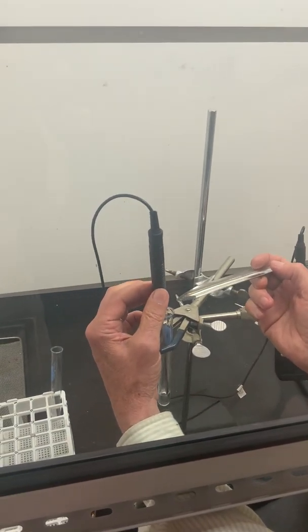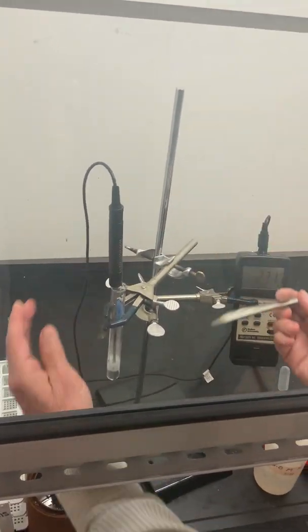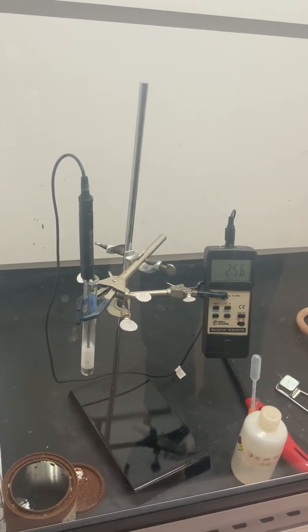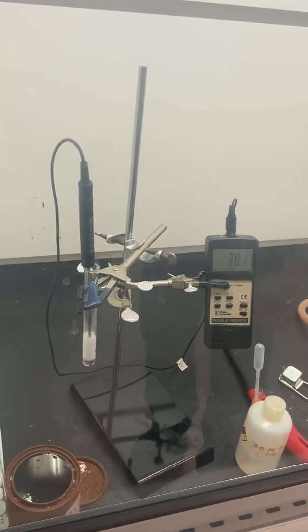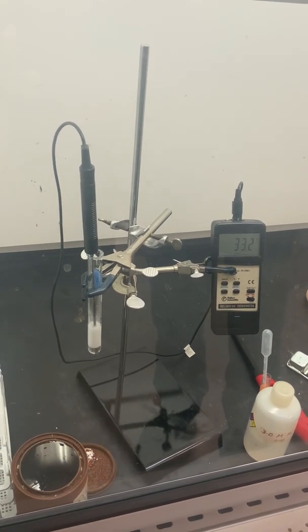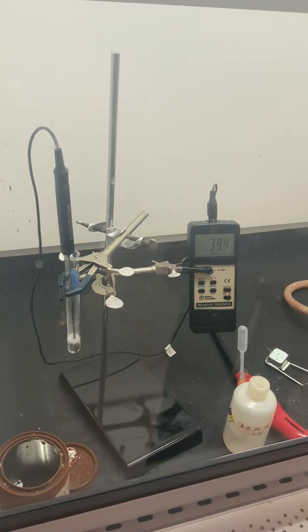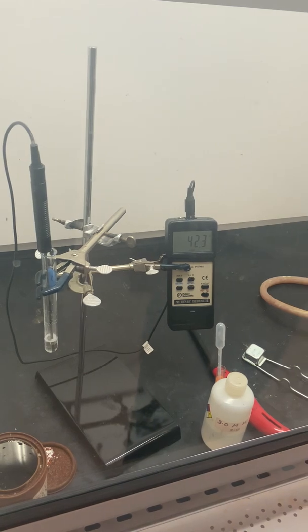Here comes the magnesium into the HCl. And so, what are the primary observations you make here? The obvious one is the evolution of that gas. You can see the furious bubbling there as the magnesium and hydrochloric acid react. And the other important observation is you can watch the temperature of the surroundings, the water and the HCl there, increase dramatically.